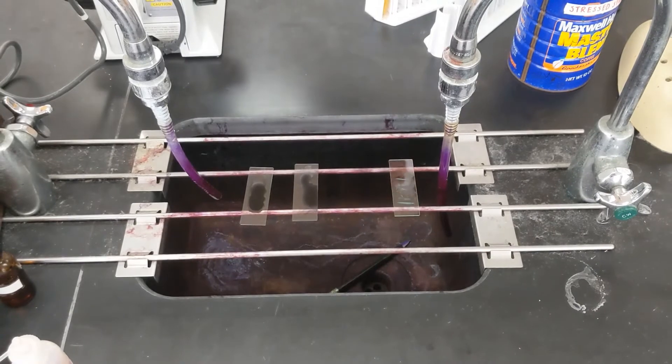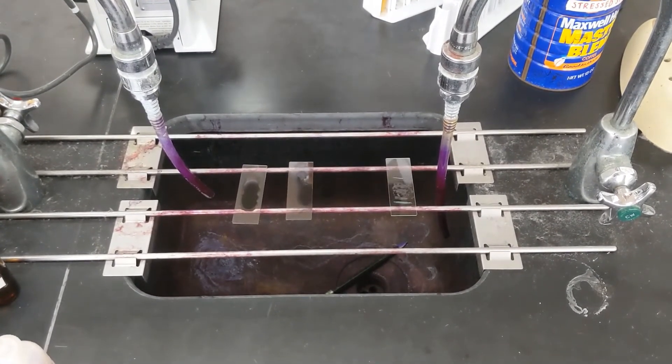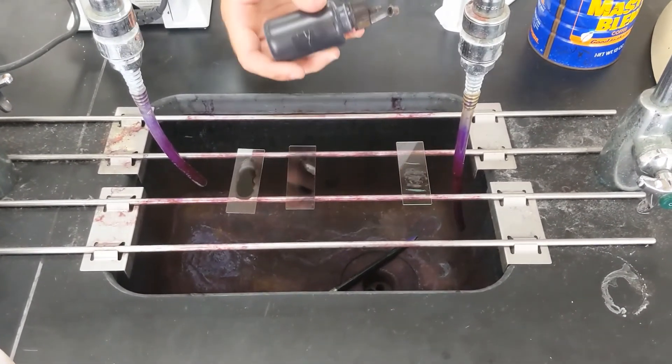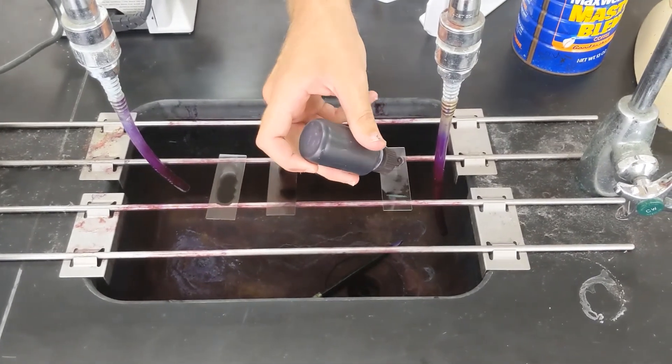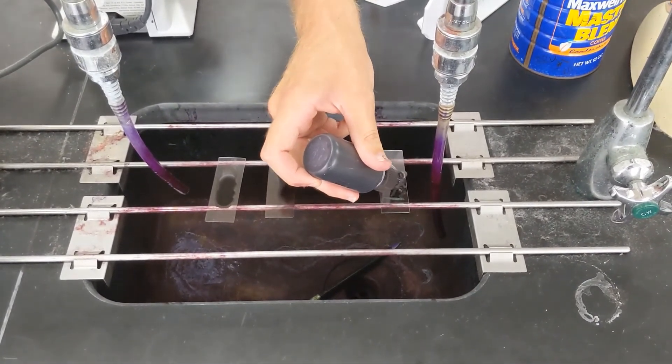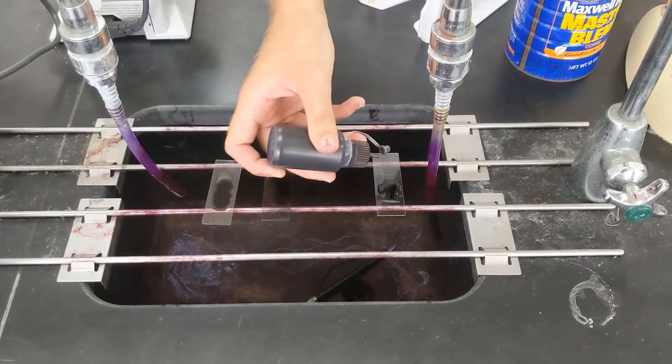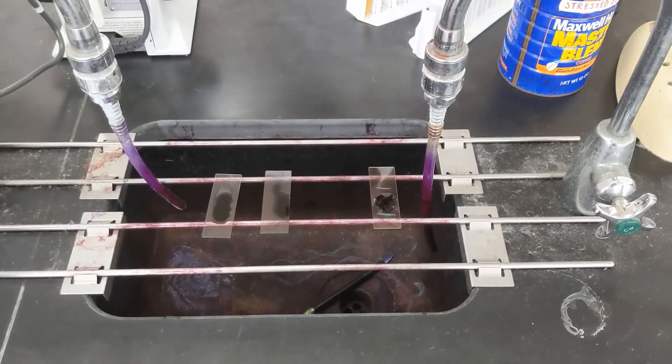So then after we heat fix the slide, we'll add our methylene blue, which is our direct stain. What you're going to want to do is cover the sample area with this stain and then let it stand for 30 seconds to a minute.